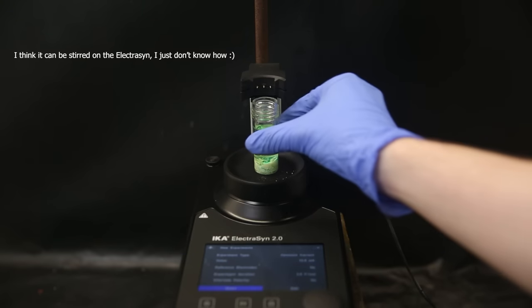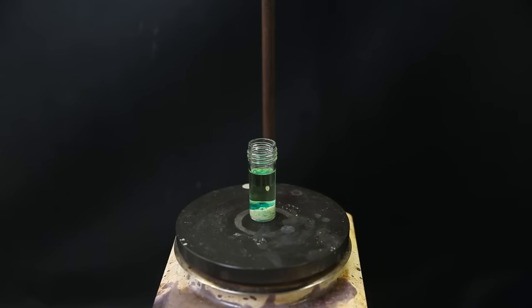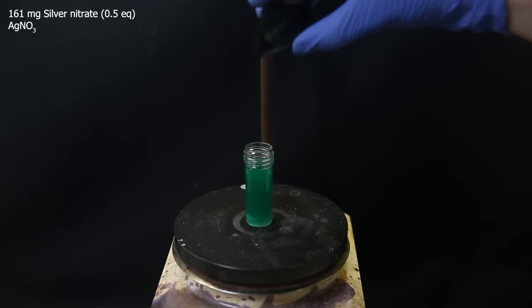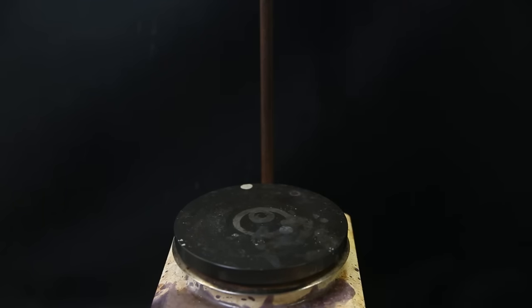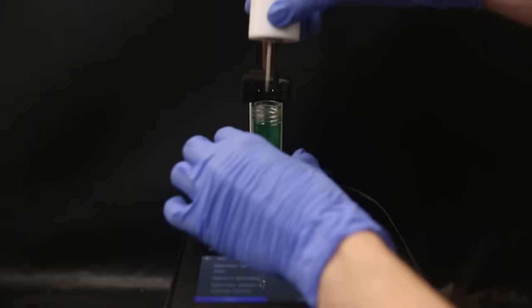I then take the vial to a normal stir plate and let it stir until it pretty much all dissolves. Since I hate working with mega small amounts, I am doing it on a larger scale and more concentrated than the literature, so it might not fully dissolve, but we'll see how it turns out. Then when it looks like nothing more dissolves, I add in 161 mg of silver nitrate as the final reagent, and the reaction should be started ASAP after the addition, otherwise the yield will be reduced. So I take the vial and then screw on the cap with the electrodes.